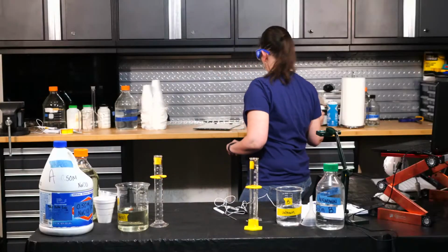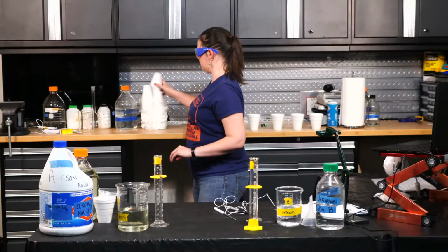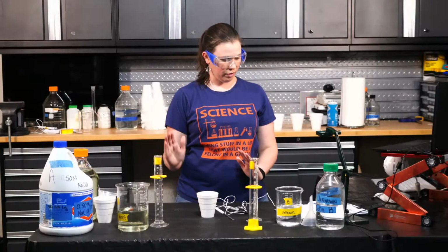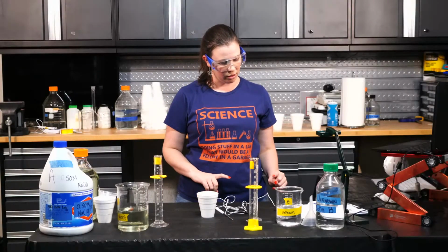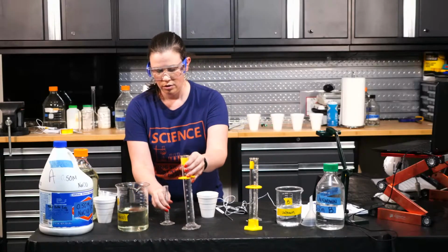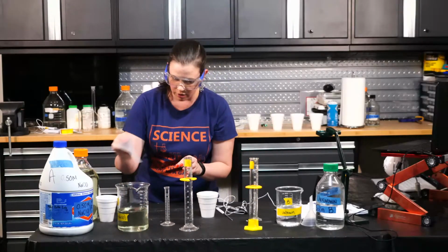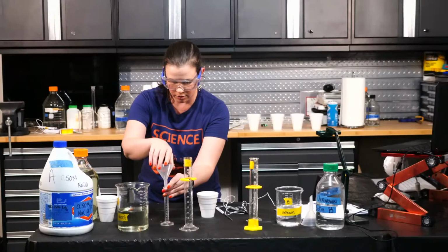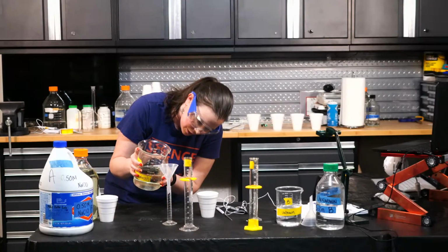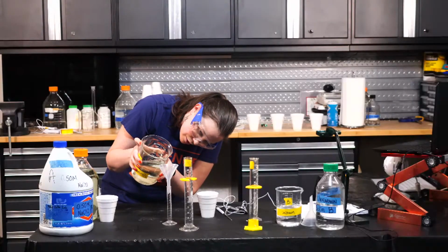Now that I have the right glassware, let's go back to level 1. So we've done levels 2 through 5. Now we're going to go back to level 1, where it was only 5 milliliters of the bleach. So again, I'm going to use the graduated cylinder here to try to pour only 5 milliliters of bleach. Very slowly.